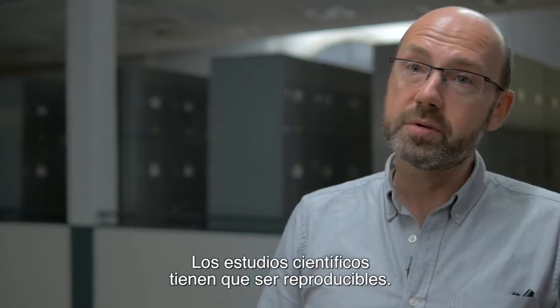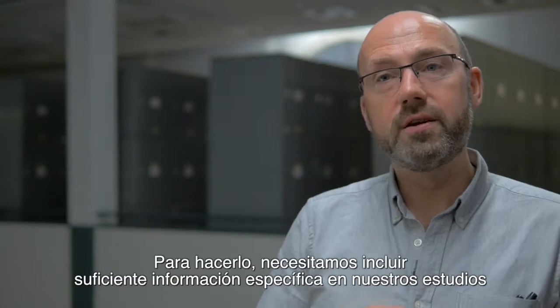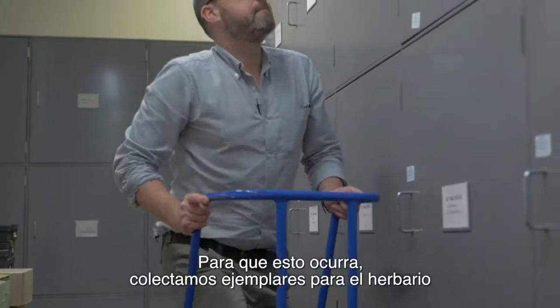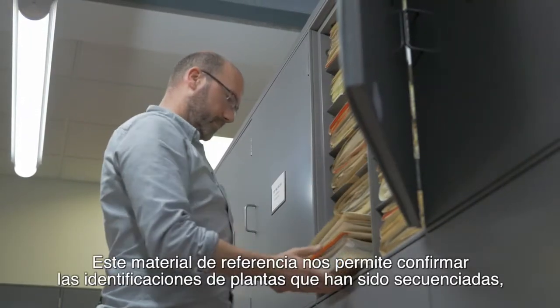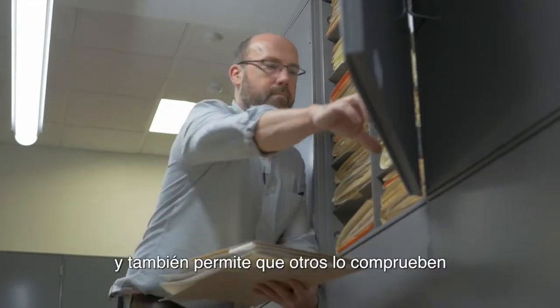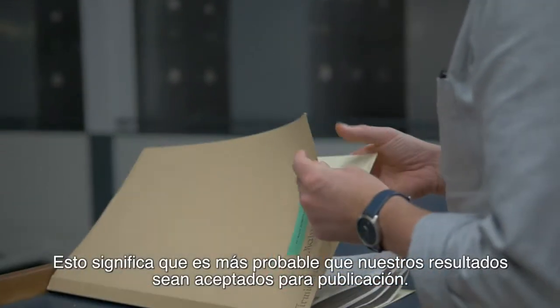Scientific studies have to be reproducible. In order to do that, we need to include enough specific information in our studies so that other people can reproduce and test our results. We collect herbarium specimens along with the silica dried material. This reference material allows us to confirm identifications of the plants that have been sequenced and allows others to check this, meaning our results are more likely to be accepted for publication.